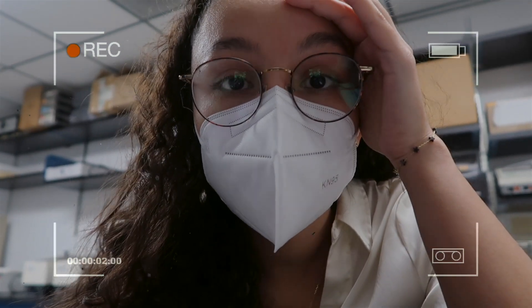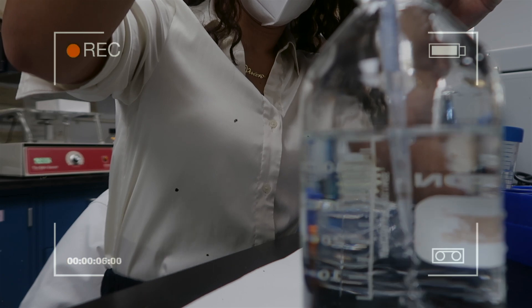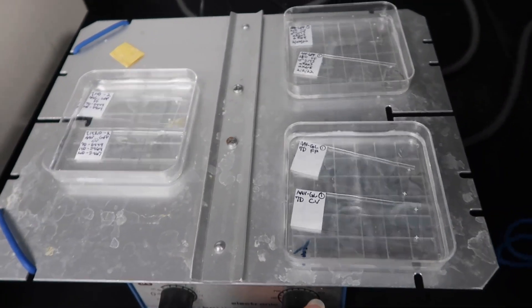I just messed up so, so bad. Day two of this immuno, I'm about to make my secondary antibody. Actually, I have to do washes first. So let's start washes and then we'll make our secondary antibody and then we'll figure out this ink cartridge situation.